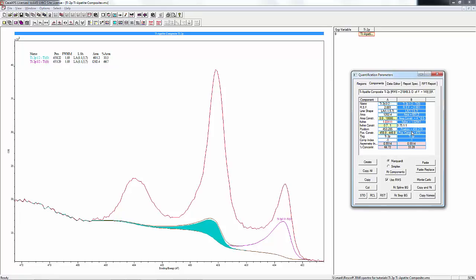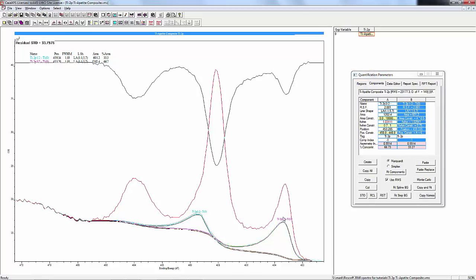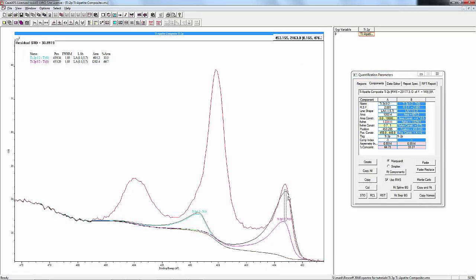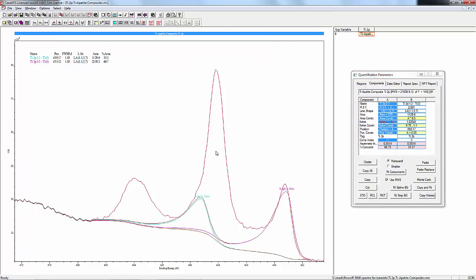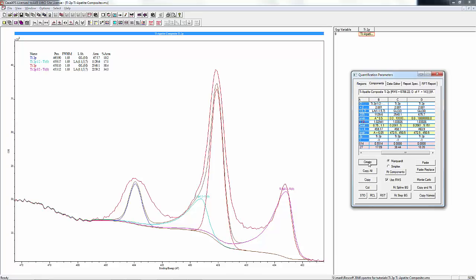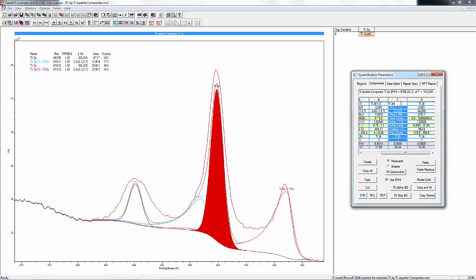The position constraints - the 1/2 is A plus 6.05 eV above. So that's a good start for the titanium metal species. We won't hit fit just yet - we're going to add in the peaks for the titanium oxide species. Let's add those in and I'll take a little bit and go through and set those up as well, and I'll come back and show you what I've done.